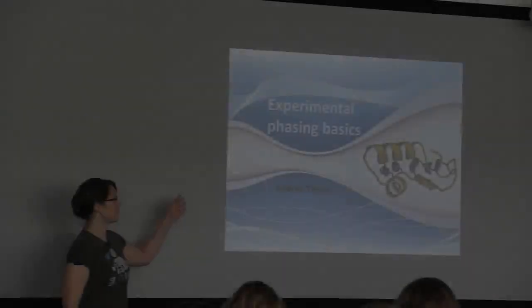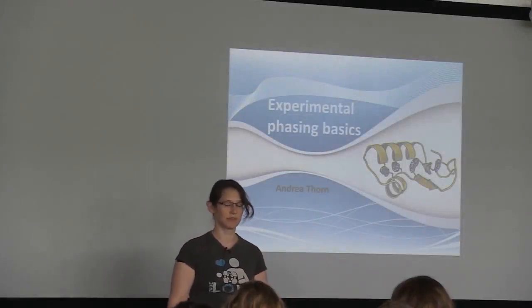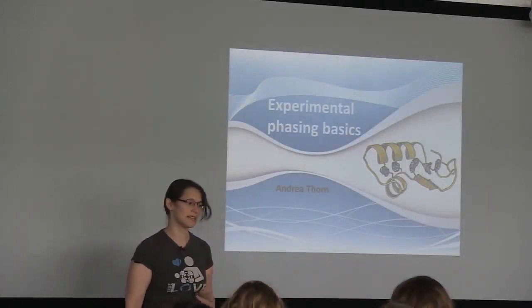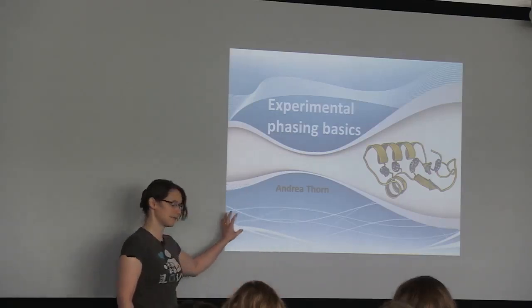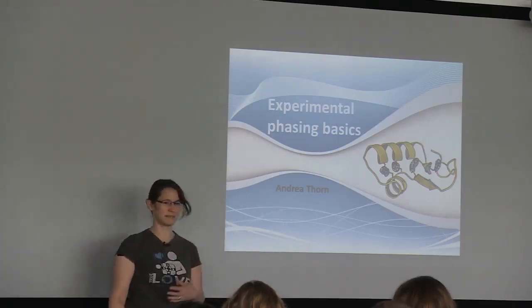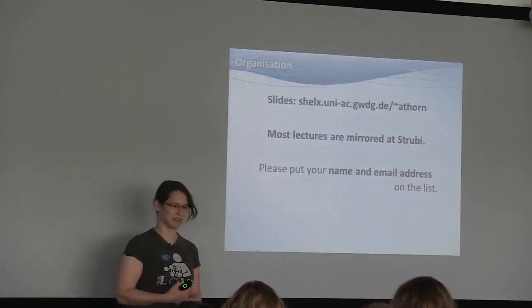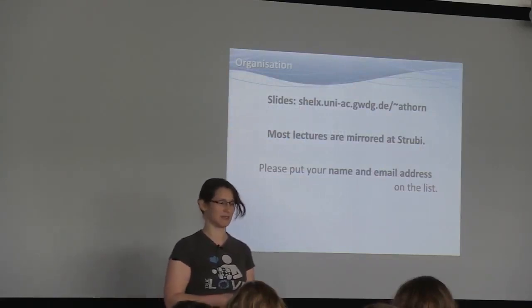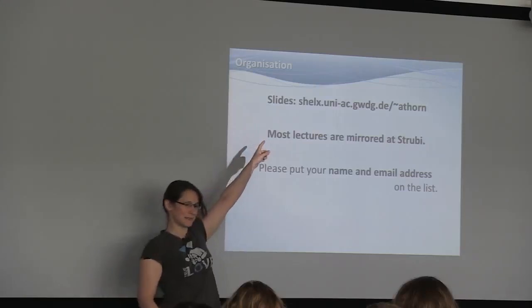I'm going to talk about basics of experimental phasing. There will be 2 more lectures which deal with experimental phasing, one about anomalous map and one of advanced SHELXC/D/E usage. So this lecture will merely form some basics and some concepts. On the other hand, you are possibly one of the most expert audiences in experimental phasing I have been talking in front of. So you can find the slides on my homepage if you want them.